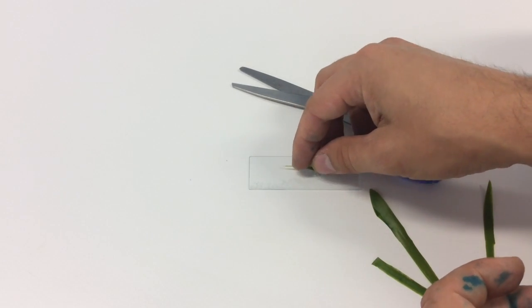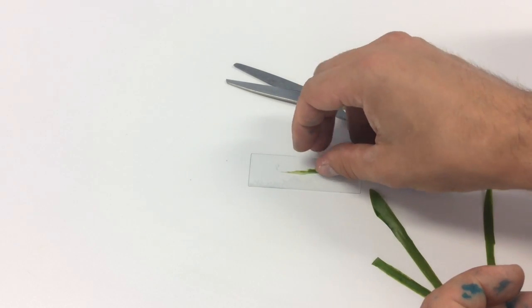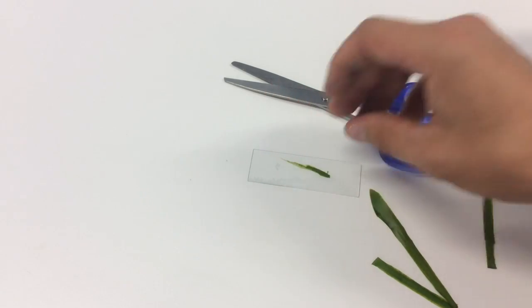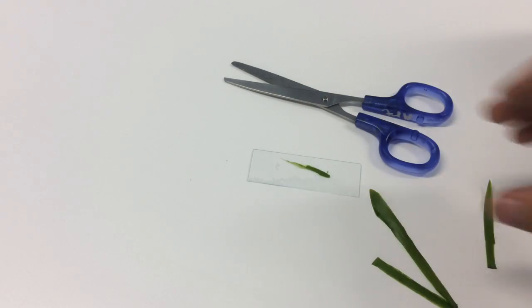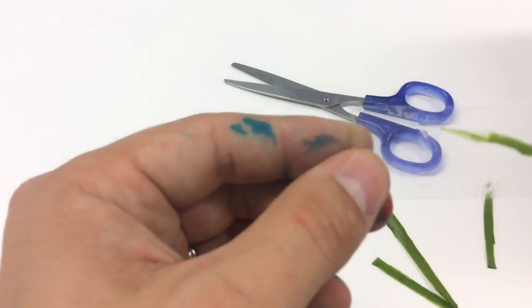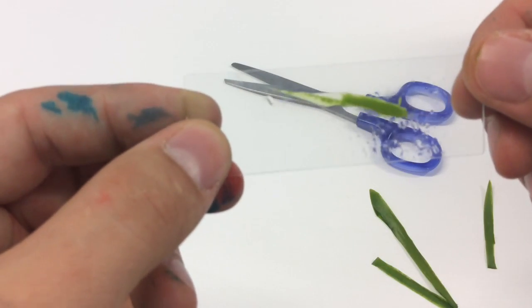And press it down to make sure that it is actually on the slide. You don't want a thick piece of this because you're trying to pass light through it so that you can view it under the microscope.